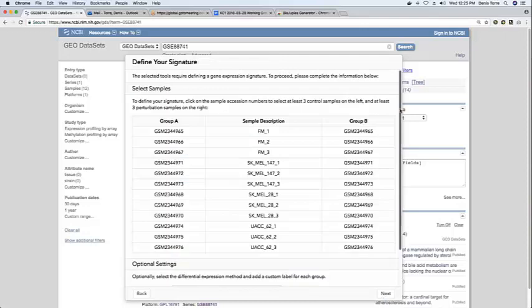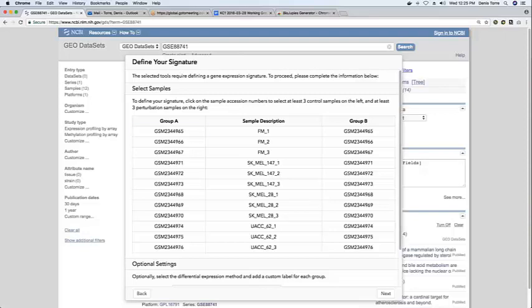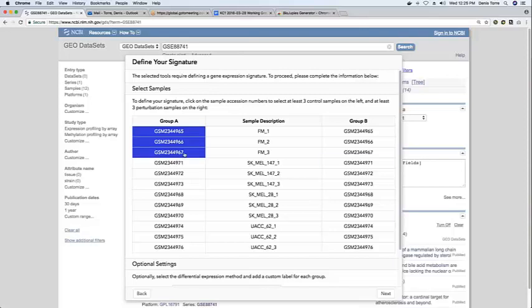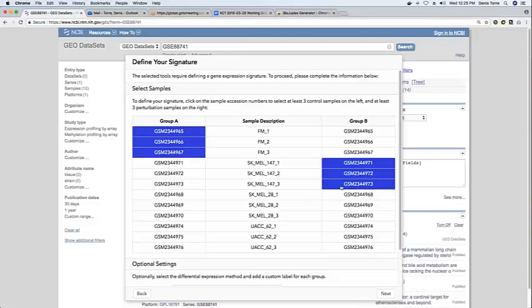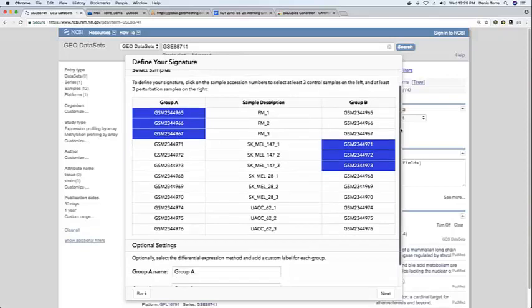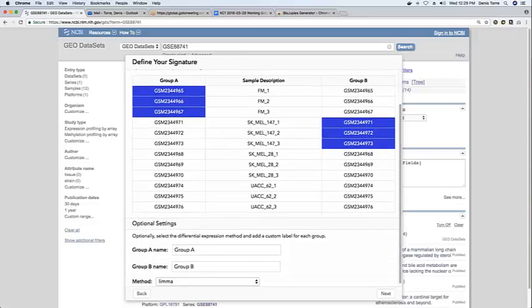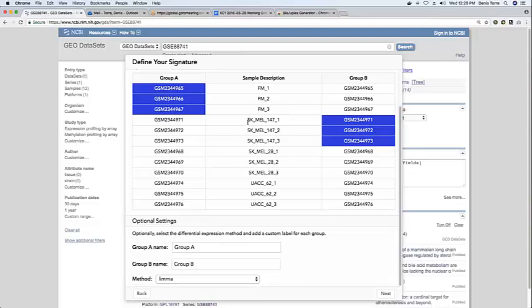And so then in the following part, the user is required to input a signature. So to define a set of control samples and a set of treatment samples for the dataset. So in this case, for example, we can select three samples which are the control group and three samples which are generated from metastatic melanoma cell lines.